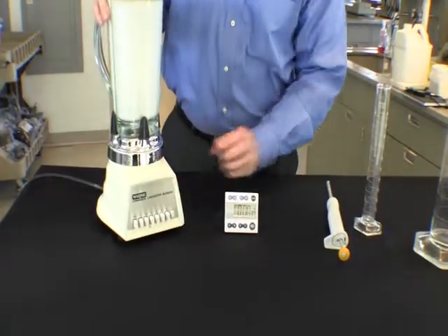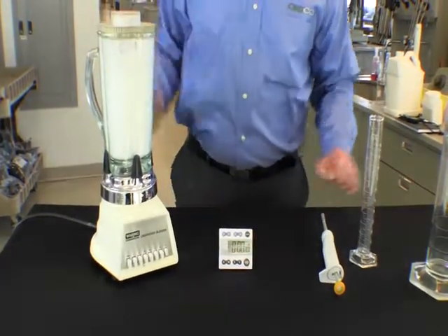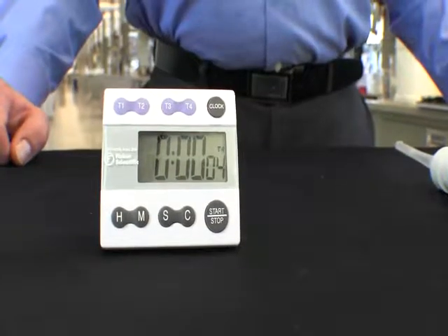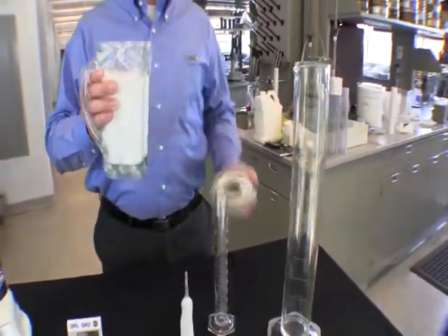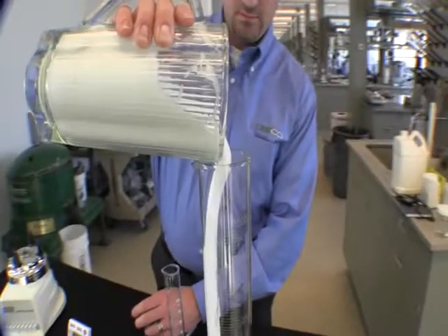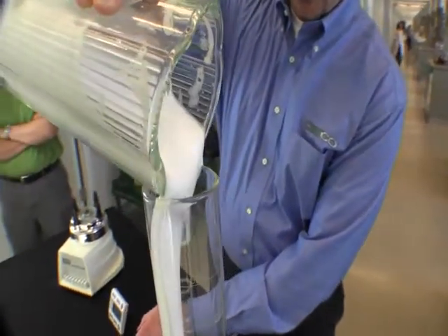We immediately start the timer, which has been preset to 30 seconds. After the 30 seconds has elapsed, we stop the blender and remove the glass chalice. We pour the foam into the graduated cylinder, starting the timer as soon as the pouring begins.